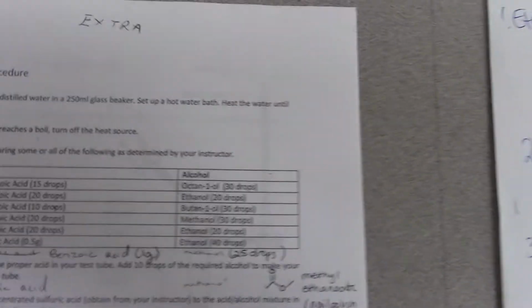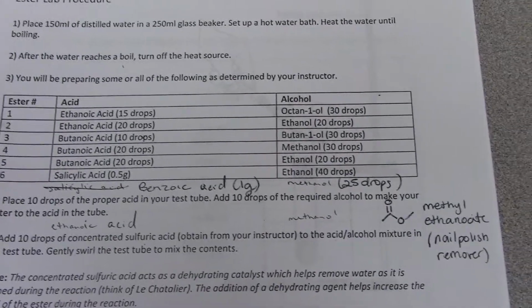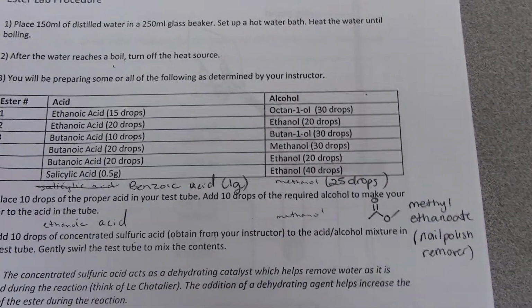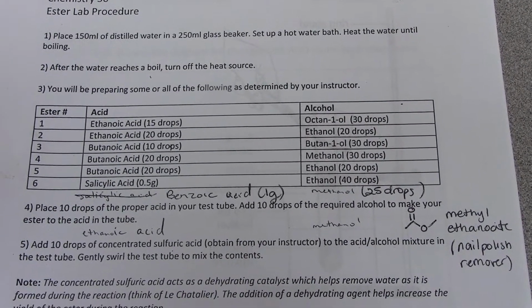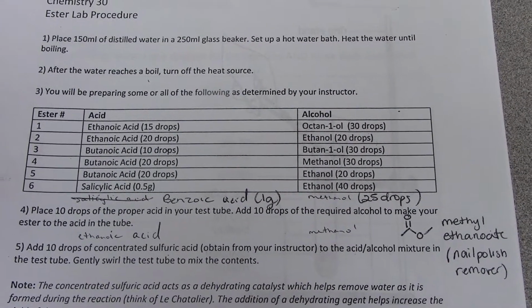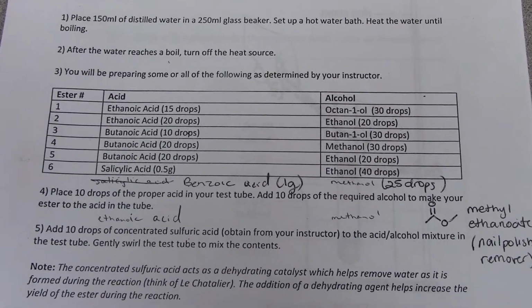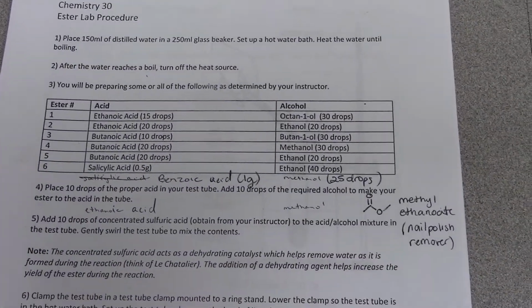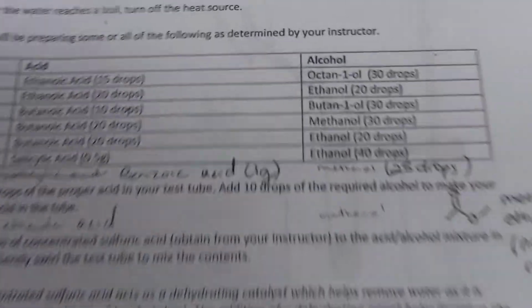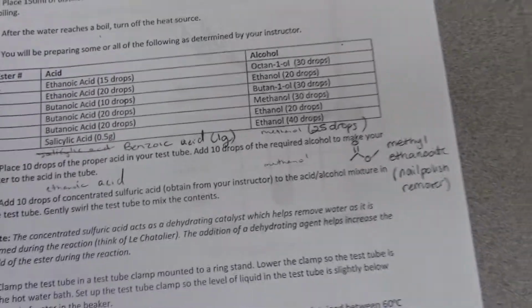If you were in class, you would be doing these 8 reactions. So the 6 that are in the table, and then the benzoic acid and methanol, and ethanoic acid and methanol. You would be doing these in class and then looking at the scents, but unfortunately you're not in class, so I'm going to do a demo. I'm going to make wintergreen, which is actually reaction number 6, salicylic acid and ethanol for an ester reaction.